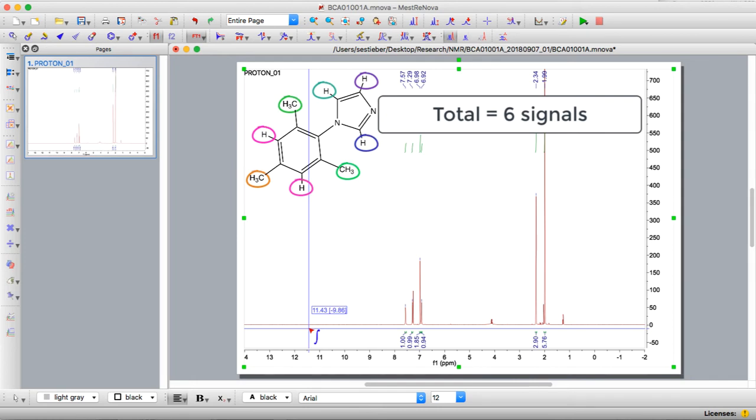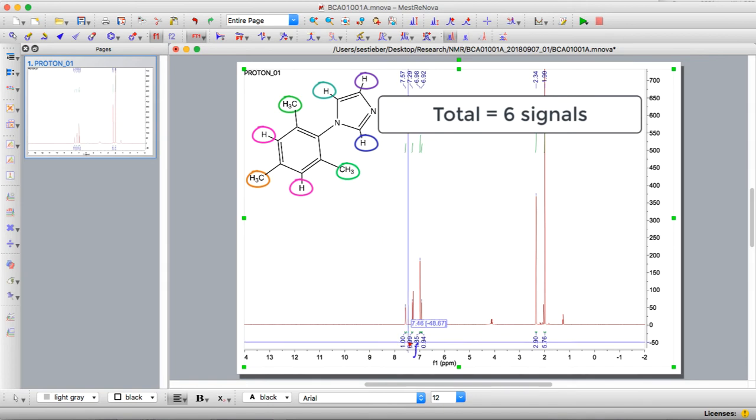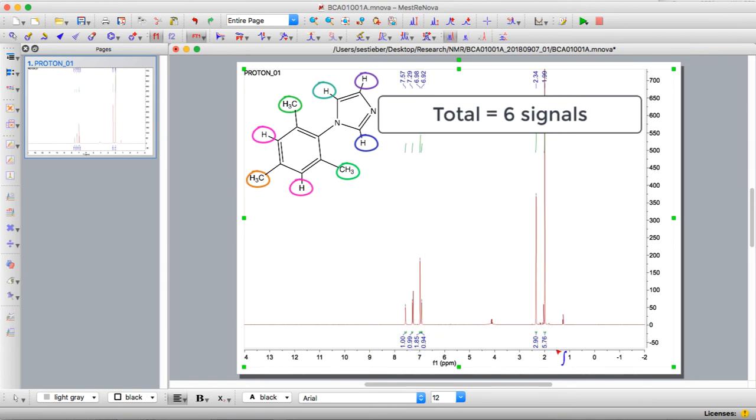We can go through our spectrum, take a look. We have one, two, three, four, five, six. So that actually fits really well with our predictions.